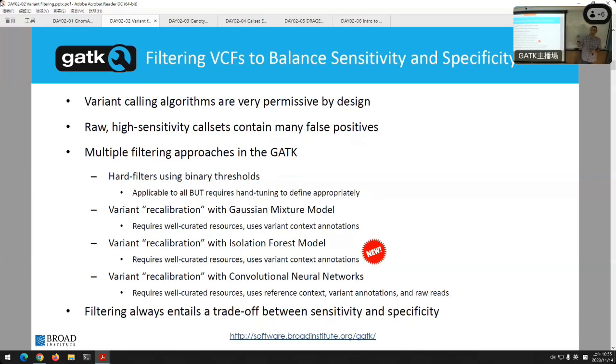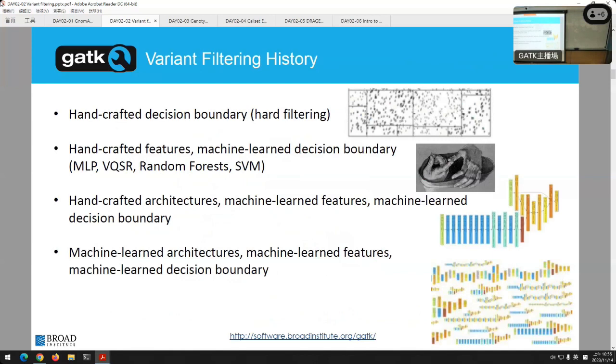We started using deep learning, and deep learning we'll go over a little bit today. And that was very powerful and very expensive to run and very complicated. And it only works with one sample. So we said, okay, there's got to be some middle ground here, and that is the latest thing. It's going to be VETS, with an isolation model, which we'll teach you. So all this stuff we're going to go over today, and hopefully I'll give you some details and show you everything.